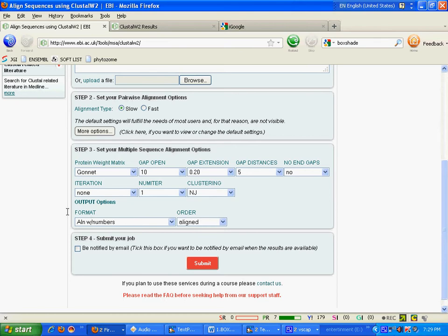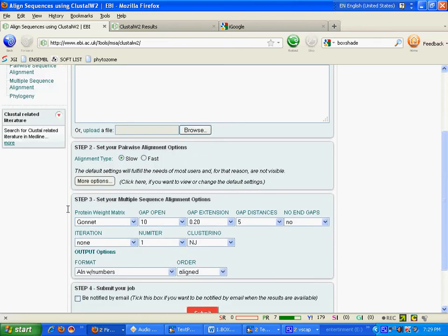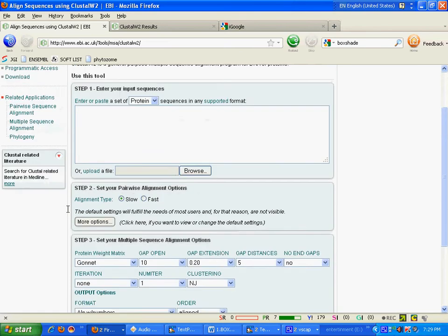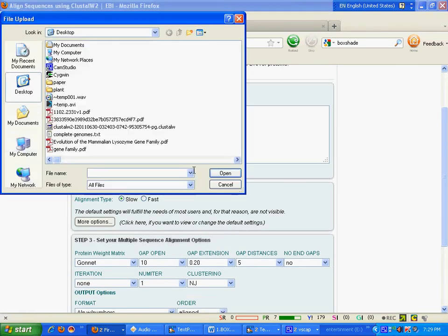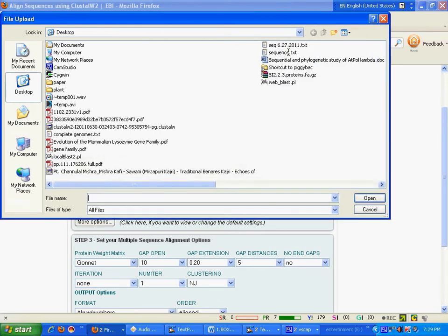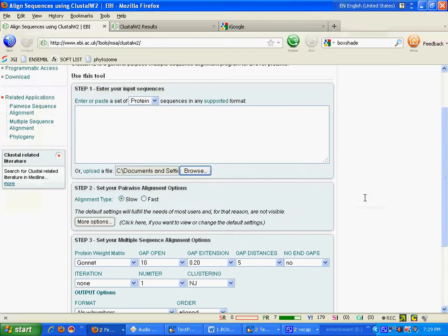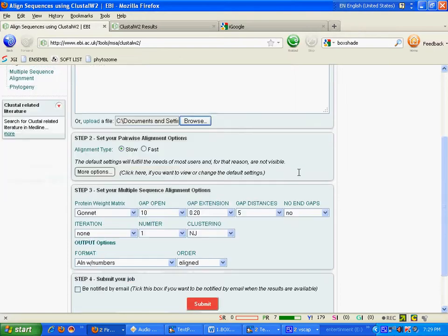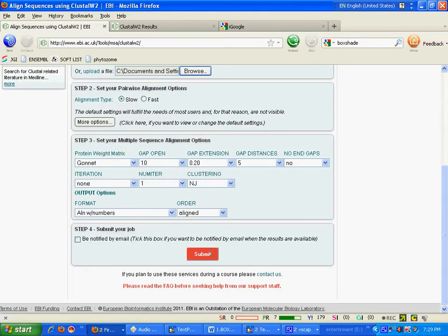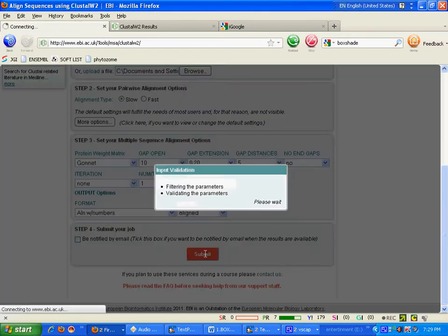So I am not going to change anything here. I will give my sequence file. This is my sequence file. Open it. Now submit.